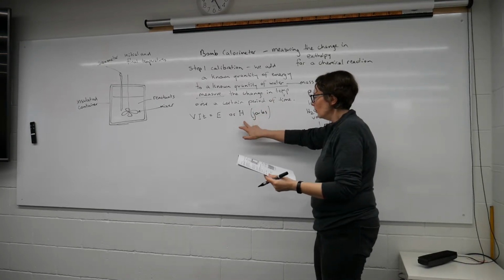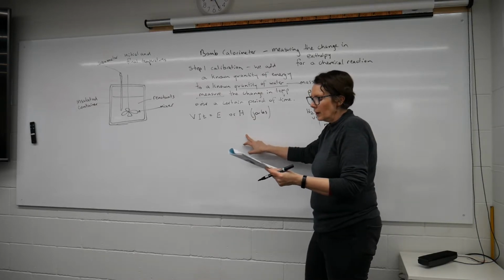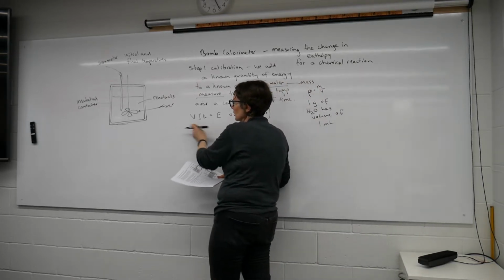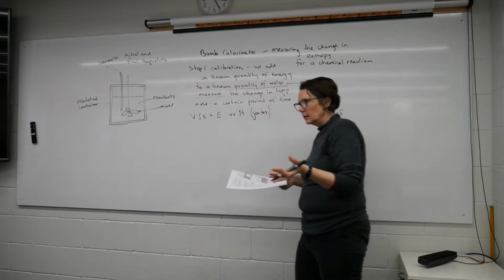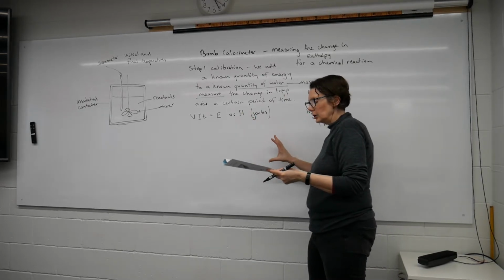And then what we need to do then is to find out the calibration factor. So we want to measure the energy in, and then the calibration factor will be that divided by the change in temperature.